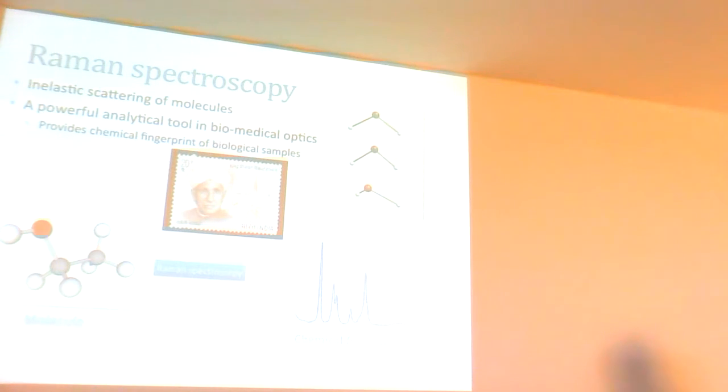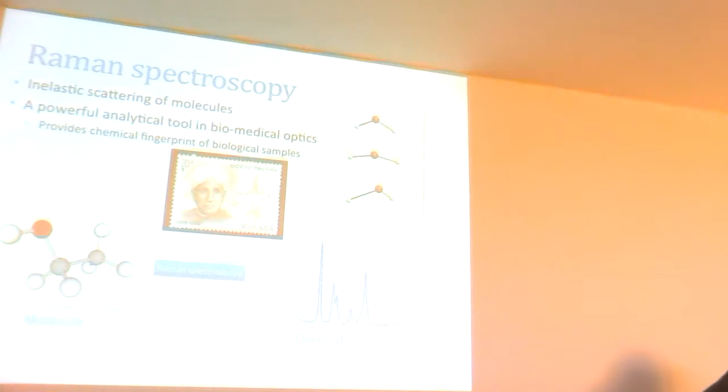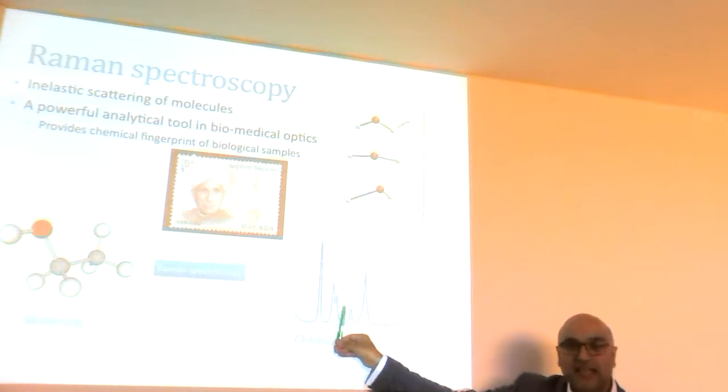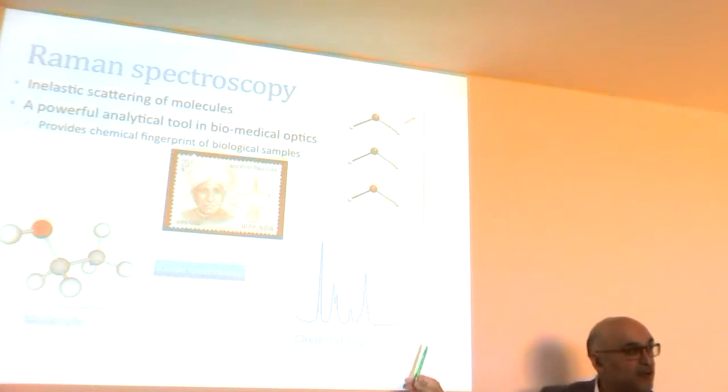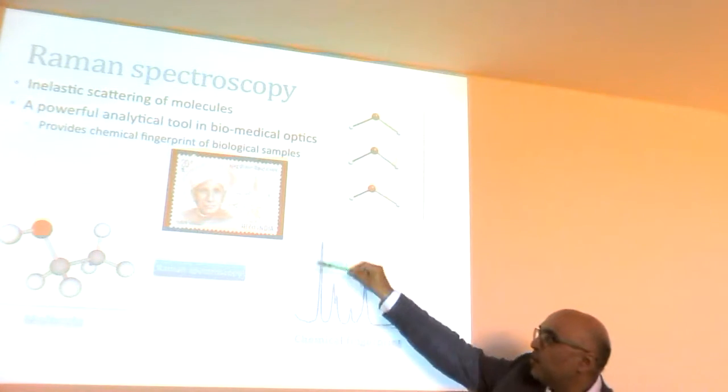That's really it. And that shift in energy is not as pronounced as my little drawing there, where you can see the shift by eye. It can be, but it can also be very subtle. Depending on the vibrational and rotational modes of the molecule of interest, that shift should change. And each of those vibrations and oscillations would lead to a different shift in energy. So I plot that here in what's called wave number, cm to the minus 1. Tens of gigahertz, 30 gigahertz is 1 cm to the minus 1, and I'll have a y-axis here.